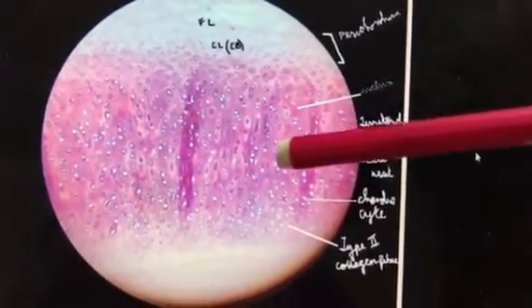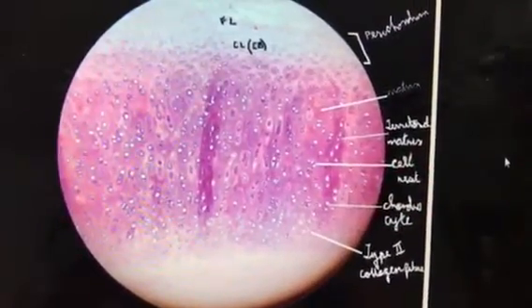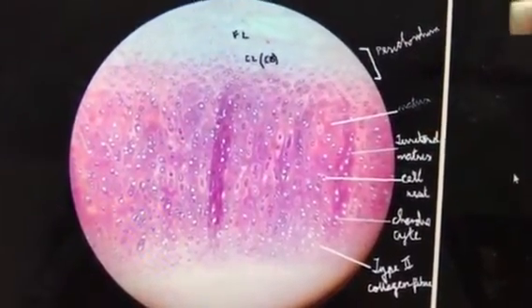Hello students, we are going to discuss a few important discussion questions on these histology slides. First we will see the cartilage. Only 3 slides are there. One is hyaline cartilage, another one is elastic cartilage, and the third one is white fibrous cartilage.